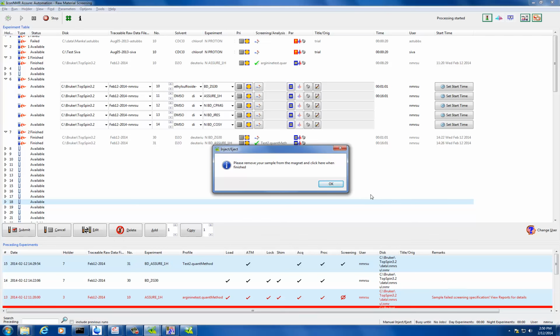Any material, it doesn't matter. But for the reference standard, you want to choose something that doesn't degrade too fast, so you would not use a sugar as a reference standard. What do people normally choose? Caffeine is very popular because it's very easy to analyze, but it also degrades. We want something that's not normally in cranberry, just as a reference. You're talking about an internal standard? No, external. The external could be anything. It doesn't matter.